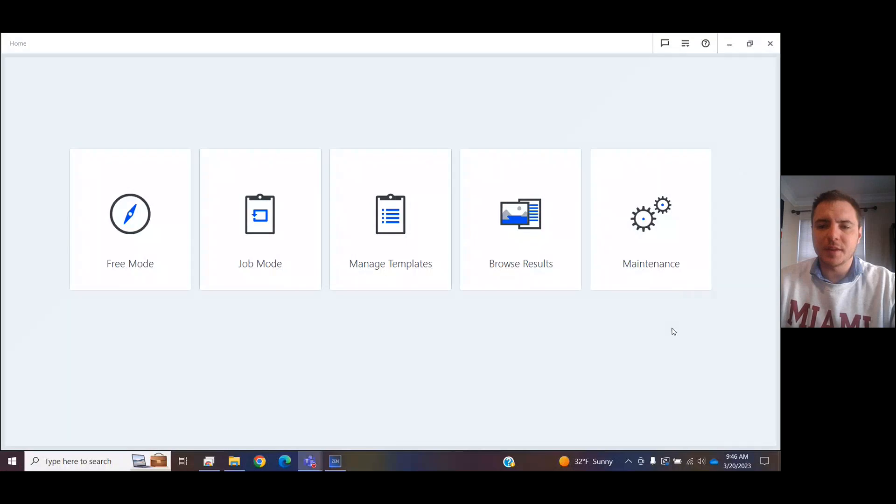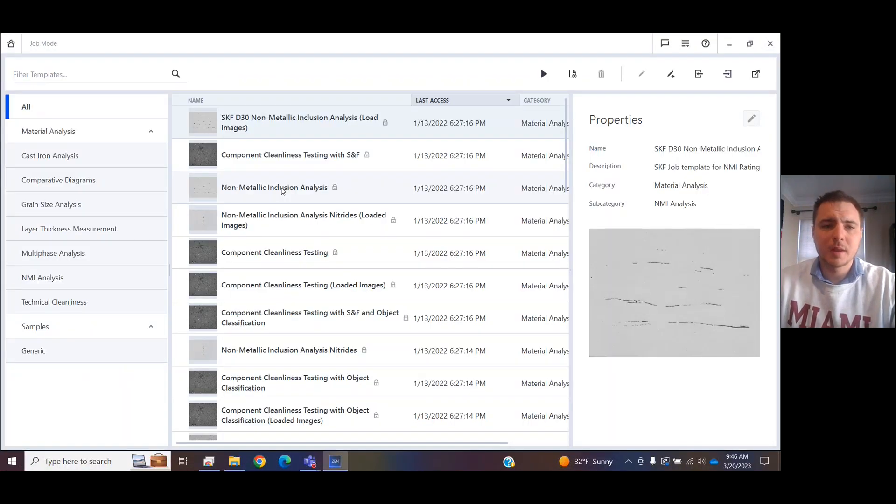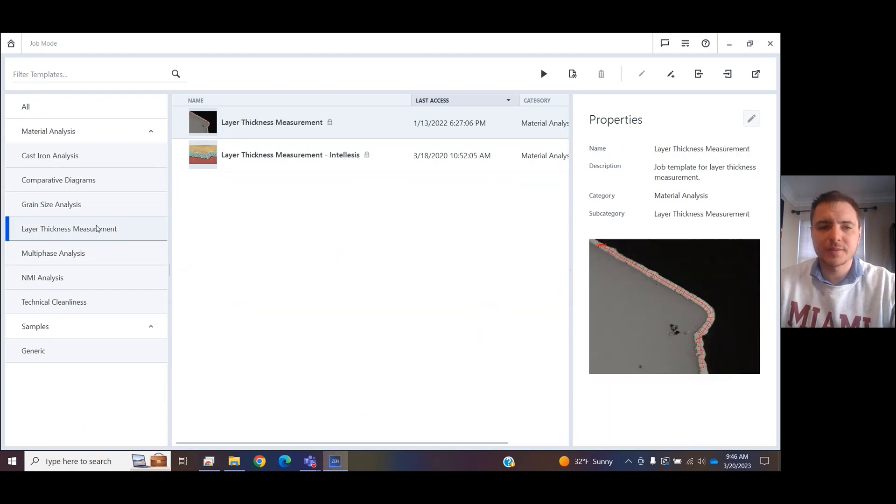Let me share my screen. When you get into the ZenCore menu, please select Job Mode, and then let's go to Layer Thickness Measurements.